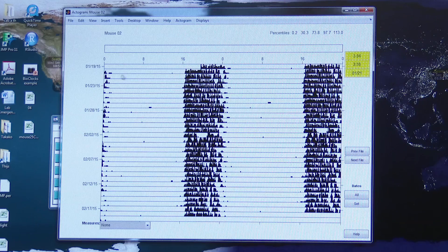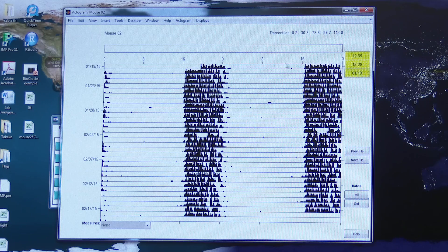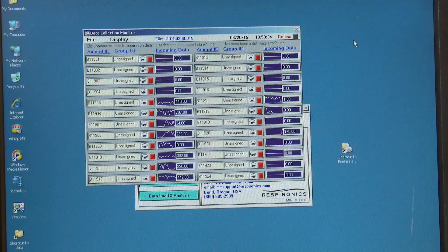In this video we're going to show you how to take raw data and turn it into an actogram which can be analyzed and interpreted.